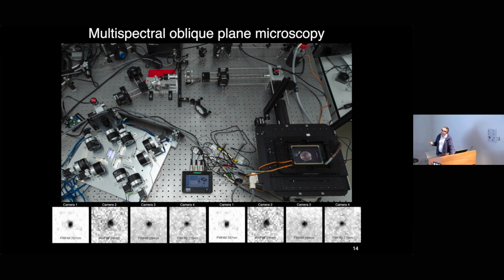This is a so-called oblique plane microscope, but for practical considerations, imagine it's an inverted microscope that also happens to be a light sheet. So you put your sample here in a normal imaging dish, a light sheet comes out at an angle, there's some horrific optics that then fixes that, and you get a nice image of that tilted plane on your camera. The other nice thing here is that the sample never moves. In order to do your Z-stack, you just move a galvanometric mirror here, and that moves the light sheet and the focal plane through the sample at the same time. So this is the only moving part, and because it's a tiny, tiny mirror, you can move that very, very fast. We have once done 400 volumes a second. I don't recommend doing that, you don't see very much, but we're not limited by the hardware in terms of imaging speed.